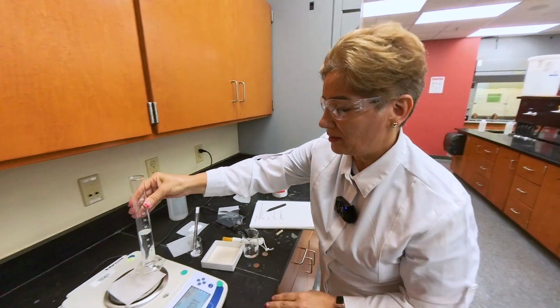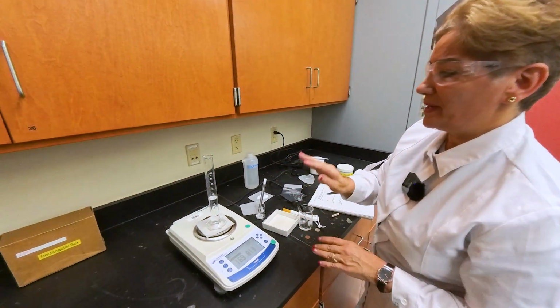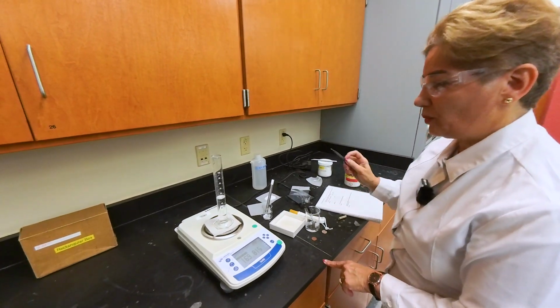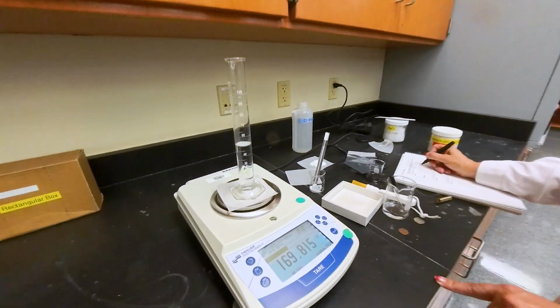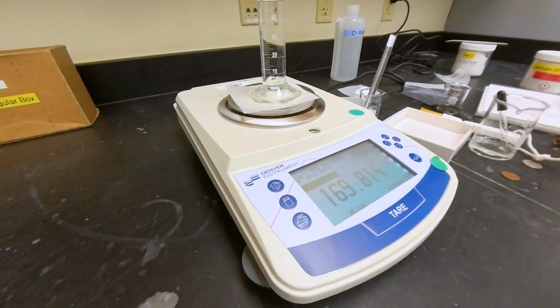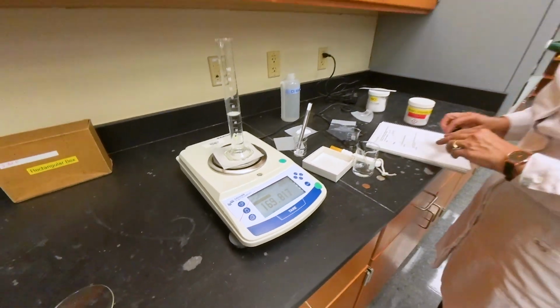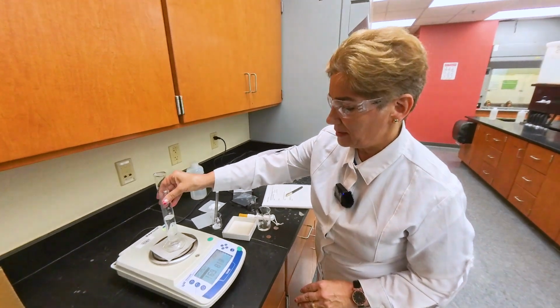I place it back on the scale, and this transferring of water is better to be done out on the side, so no water would spill on the scale. So now we have the mass for the graduate cylinder plus the water. When you subtract, you get the mass. So make sure you record these numbers and do the math.